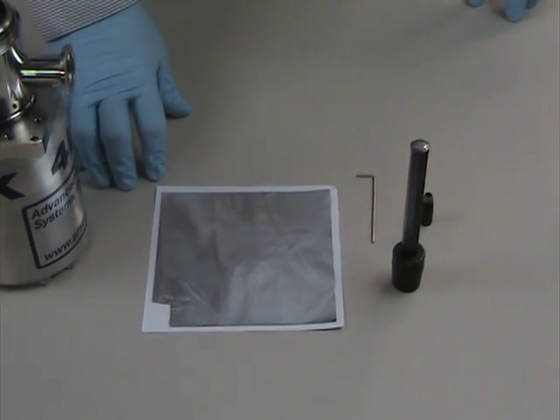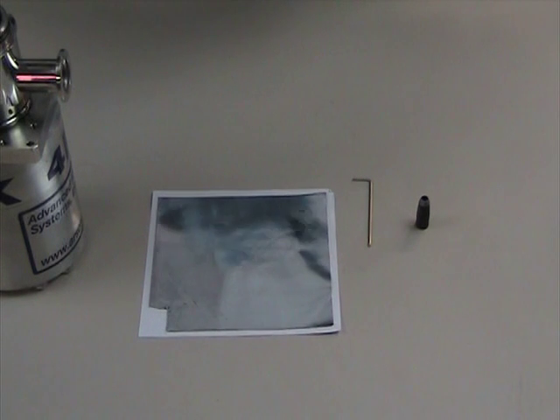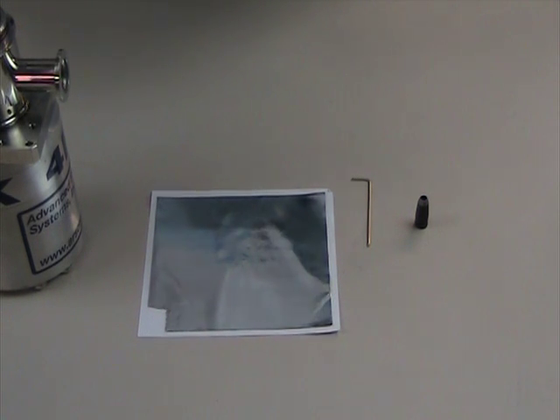This is a quick and easy way to attach the samples to the Aeros cryopullers. First off, we're going to cut an indium gasket for the sample holder. This ensures good thermal contact between the sample holder and the cold finger.